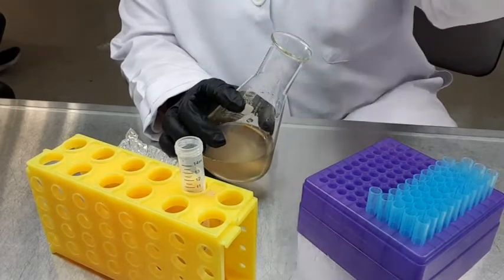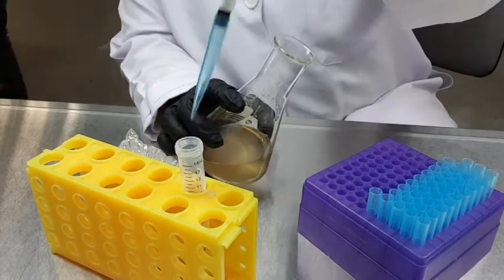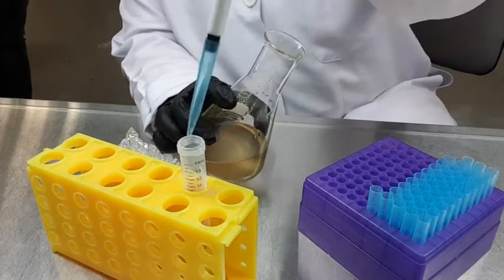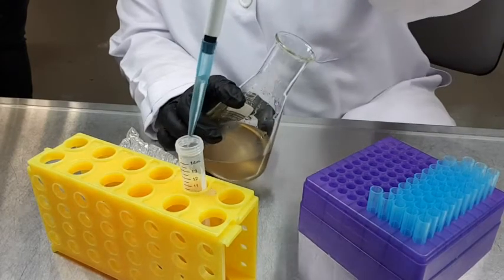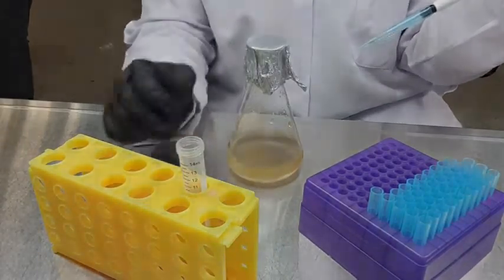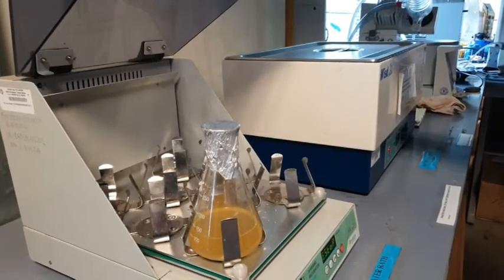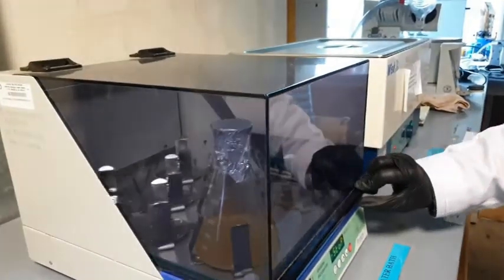The sample will be used to monitor the yeast growth by using a spectrophotometer, and also to analyze the ethanol and glucose concentration by using high performance liquid chromatography, or HPLC. The flask is then placed inside the incubator shaker at 30 degrees Celsius, and sampling will be done every 6 hours.